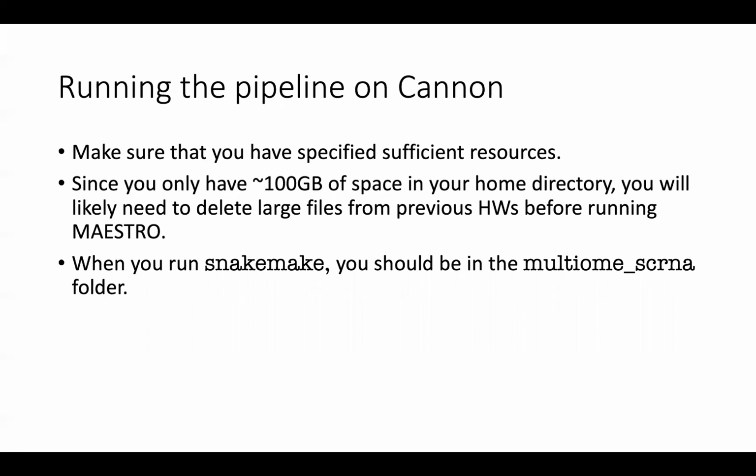Here are a few guidelines that you might need to follow to run this on Canon. First, obviously you need to make sure that you specify the correct number of cores and the correct amount of memory, otherwise it's not going to work. Also, and I think everybody will need to do this, you only have 100 gigabytes of space in your home directory.